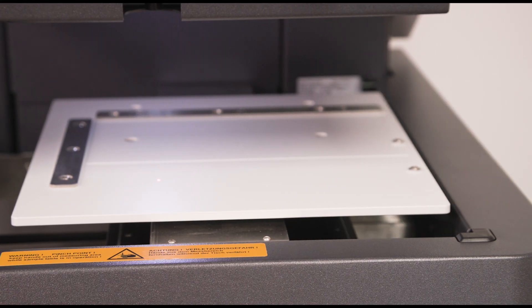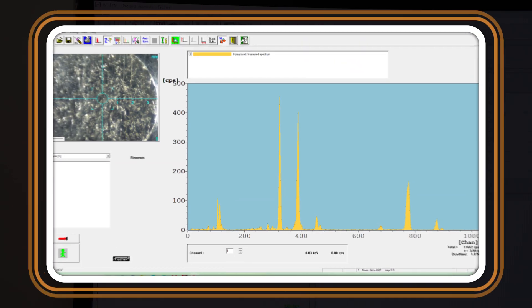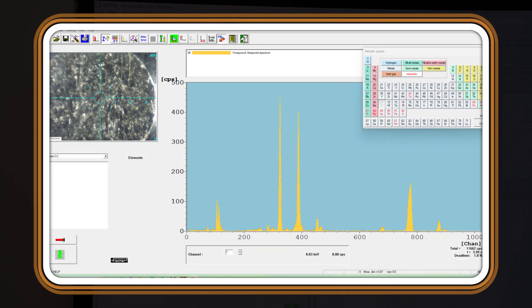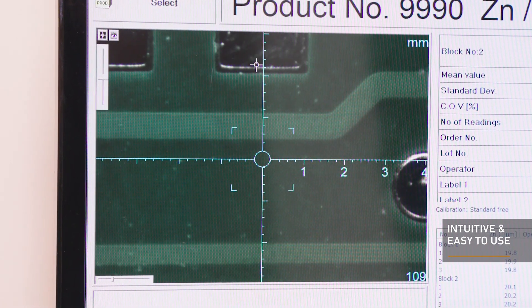Optical focusing is automatic, and a specialized safety system prevents contact between the sample and the detector. The instrument has easy-to-use software, so Fisserscope users can be up and running with their measurements quickly, regardless of experience. Clear measurement data is gathered and stored, enabling powerful reports laid out in a simple way.